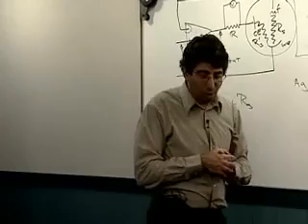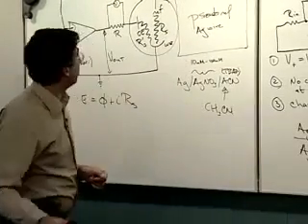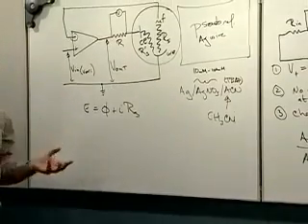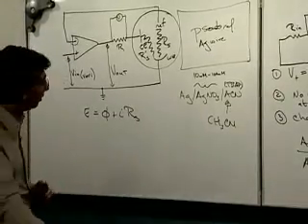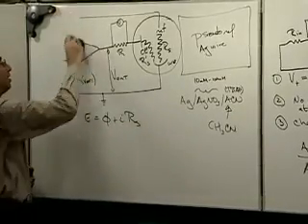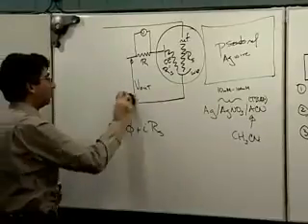This brings up one other issue, and that is, I have not been too concerned so far about the shape of the working electrode. I've been drawing squares and told you it should be small, but we haven't talked about the shape. We're going to come back to that and talk about that a bit. But let's think a little bit about the implications of the shape of the working electrode.